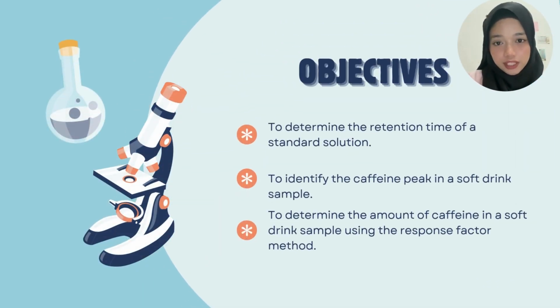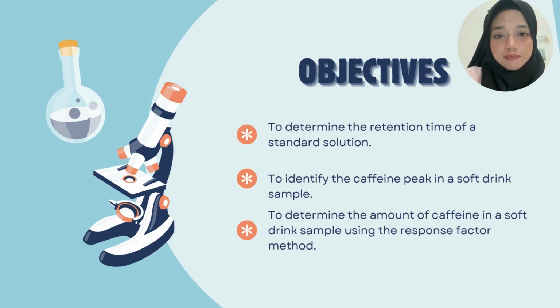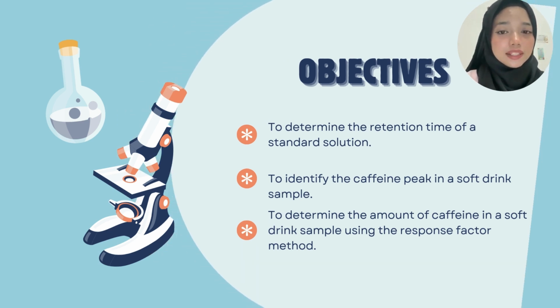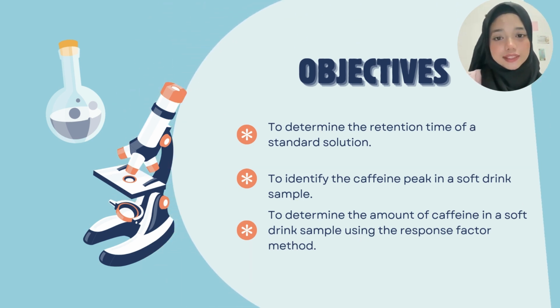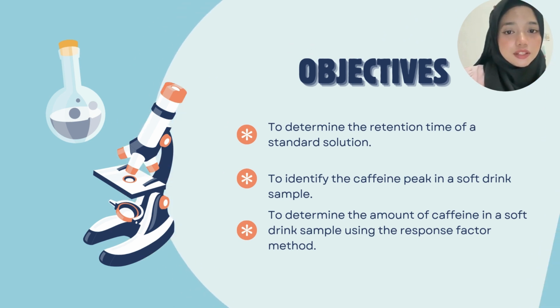Okay, next is the objective. First is to determine the retention time of a standard solution. Secondly is to identify the caffeine peak in a soft drink sample. Last but not least is to determine the amount of caffeine in a soft drink sample using the response factor method.